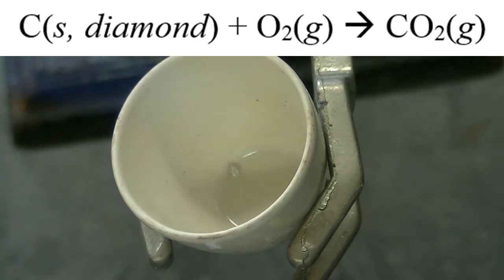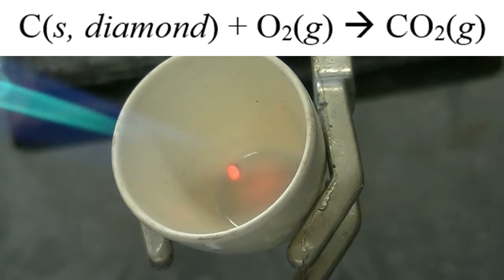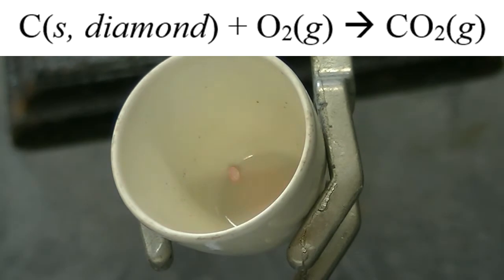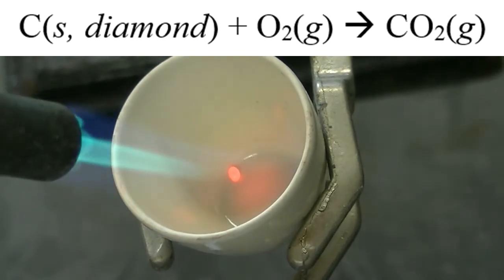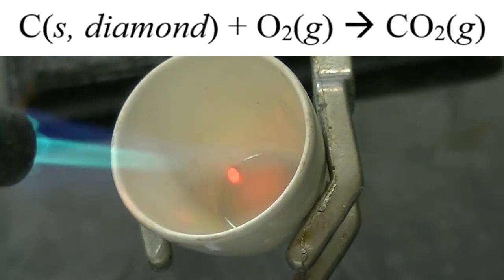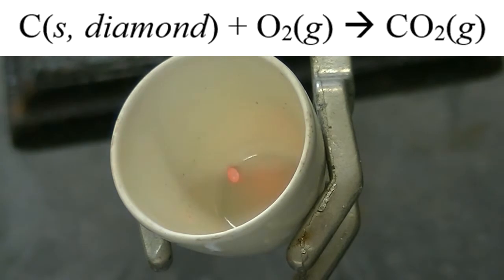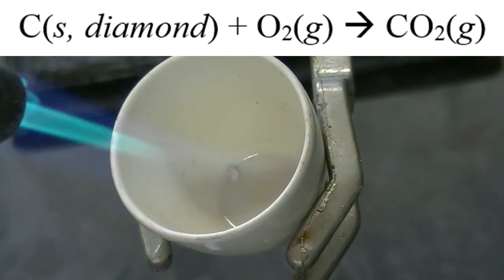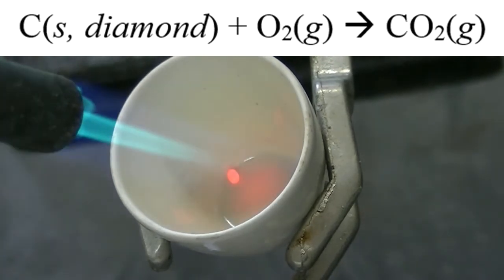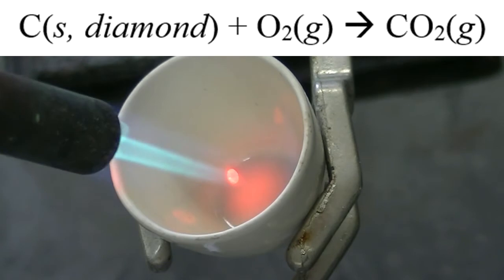Now we're going to heat the diamond in this crucible using a blow torch. When doing so, the carbon in the diamond should react with oxygen in the air to form carbon dioxide gas. It looks like the diamond glows orange hot as the reaction happens. Because the carbon is getting converted to carbon dioxide, which will escape into the atmosphere, the diamond should be losing carbon atoms and therefore losing mass as the reaction continues.